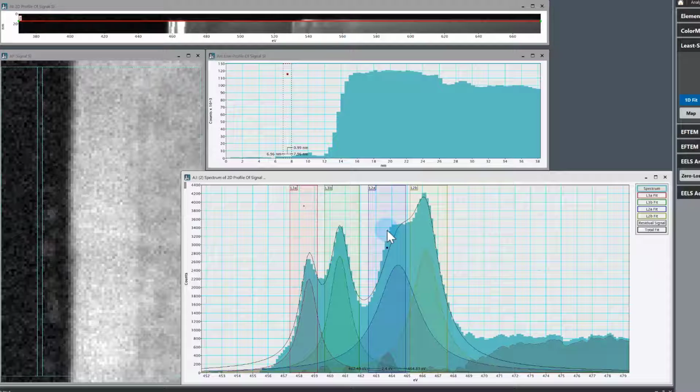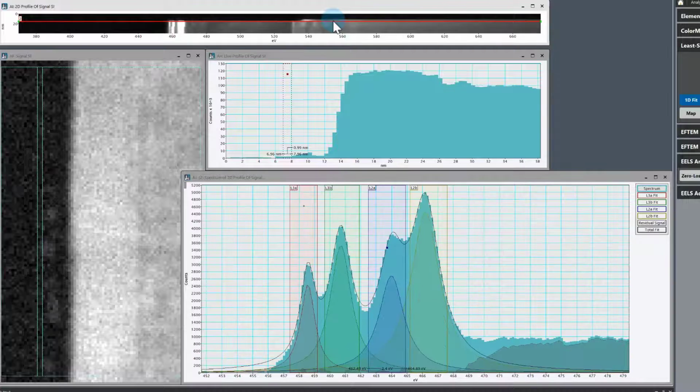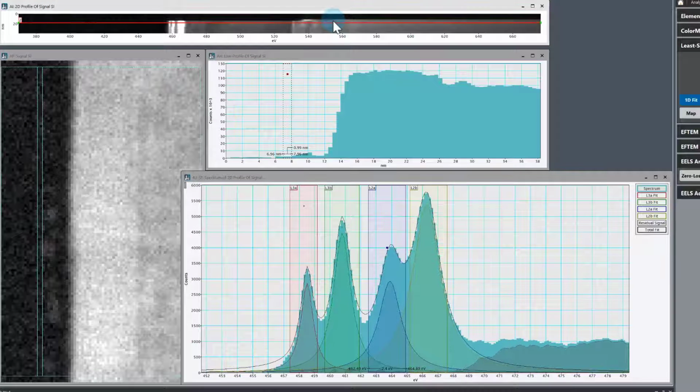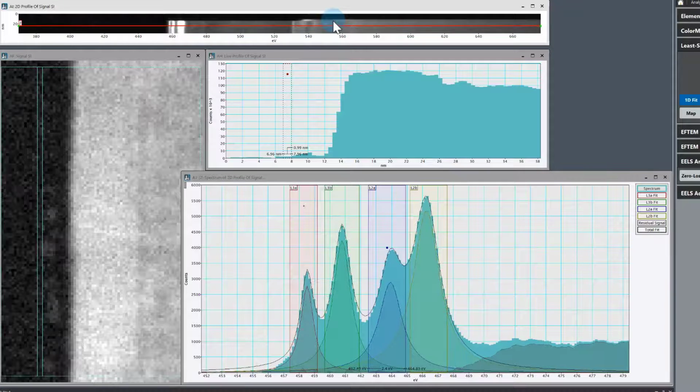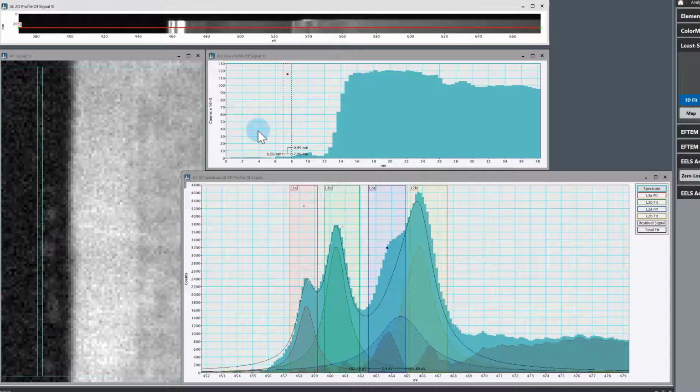Basically, things we can start to do are move our windows around a bit. Does that look right? And we can constrain parameters as well, as we saw in one of the other lessons. It looks like we have a reasonable fit in most of the STO, which is that region there. Let's see how it behaves in the BTO. Okay, that looks like there's a mistake here, but the peak tracking for the L3 is actually quite good.